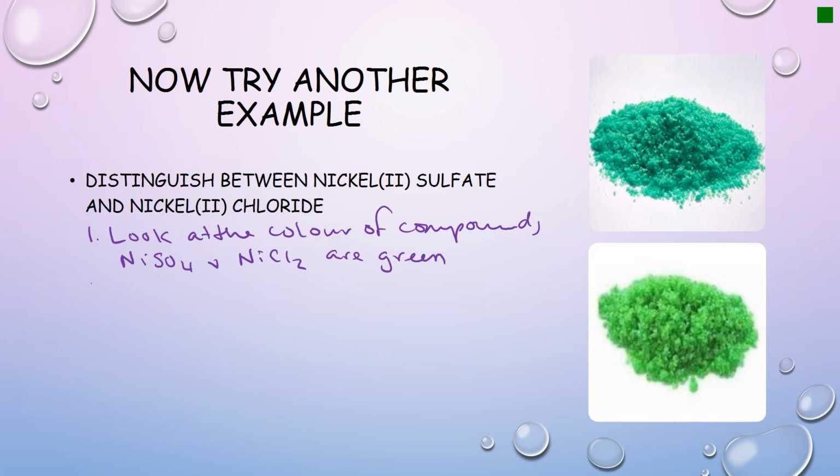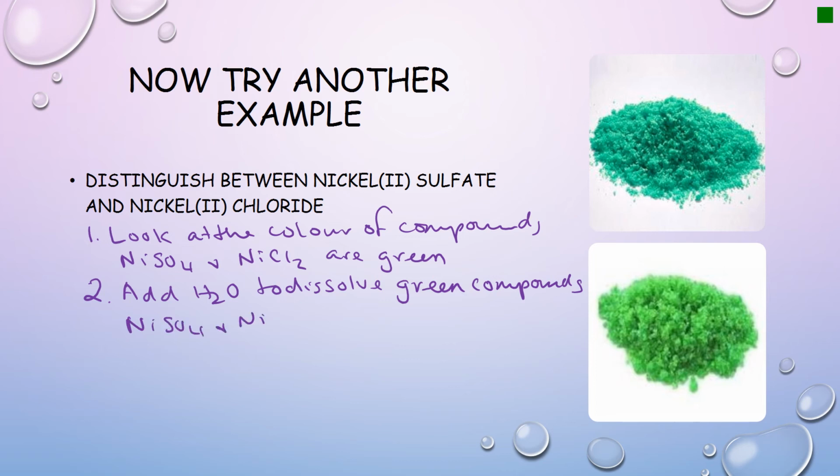Now, step number 2. Add water to dissolve green compounds. So when I check my solubility tables, I find that both nickel sulfate and nickel chloride are both soluble.